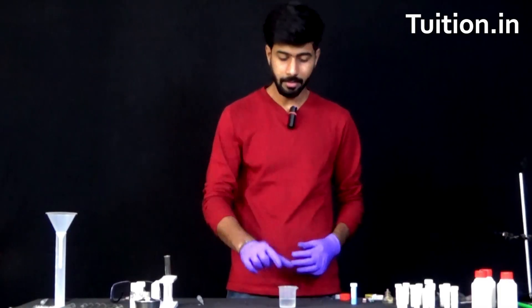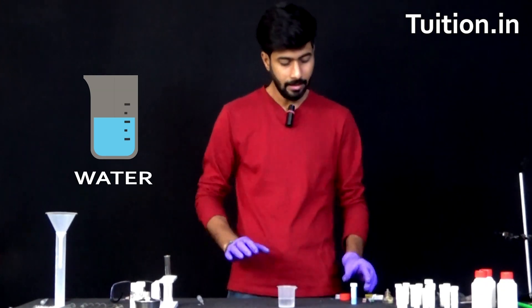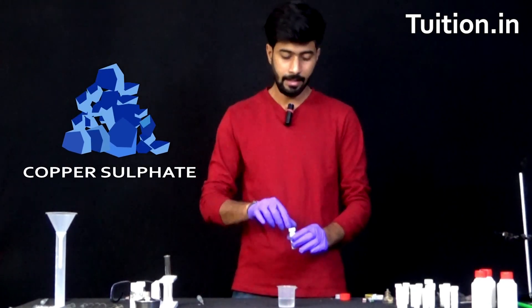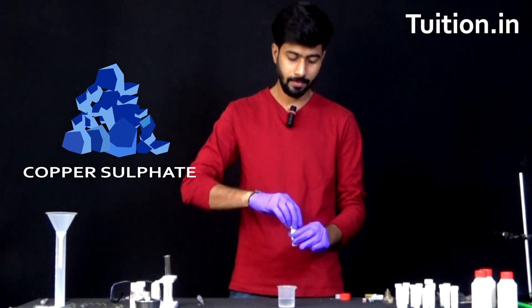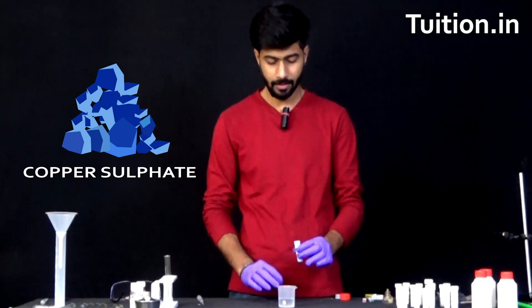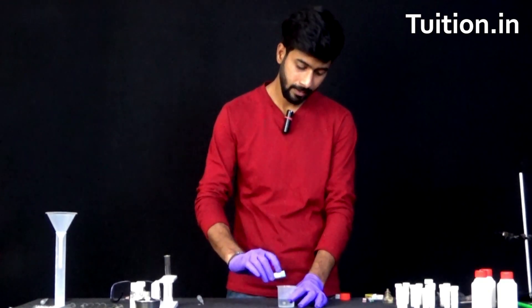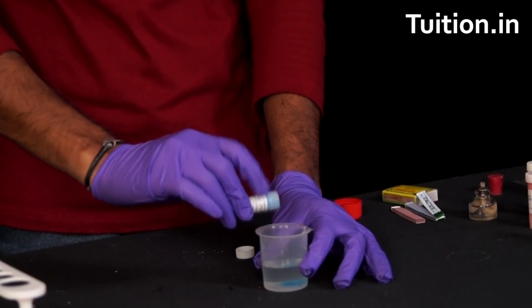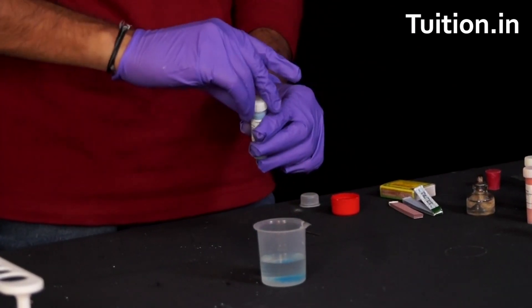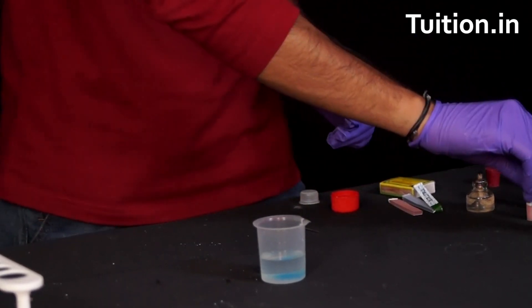To do this experiment we need a beaker with about 20 ml of water. Next we need copper sulphate salt. Let us open this and put about 4 to 5 grams of copper sulphate in the beaker. Copper sulphate is really beautiful to look at and it's blue in color. So I've put roughly 4 to 5 grams of copper sulphate in the solution. Let's close this and put it aside.